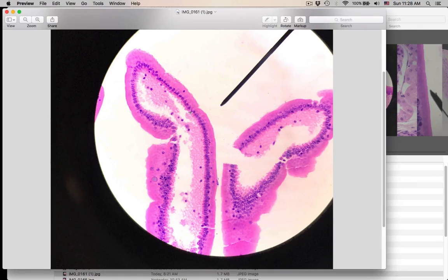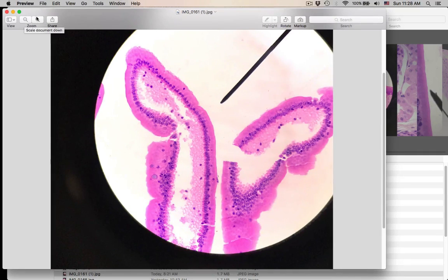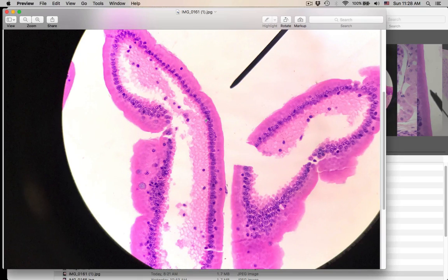The pointer's in the lumen. Now remember, you're going to be repeating a lot of the answers, so just write down what you think this is. Some slides are better than others, but here you can figure it out from right here. This is the epithelial tissue right here that I'm talking about. Pretty easy to figure it out from here. What is this? That's number 19.